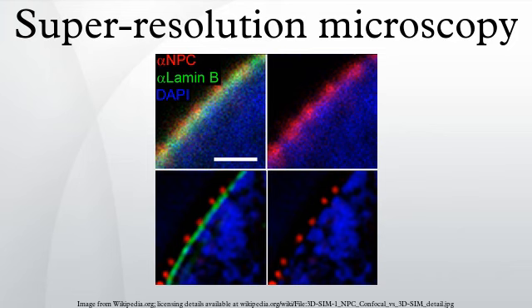There are two major groups of methods for functional super-resolution microscopy. Deterministic super-resolution: the most commonly used emitters in biological microscopy, fluorophores, show a nonlinear response to excitation, and this nonlinear response can be exploited to enhance resolution. These methods include STED, GSD, RESOLFT and SSIM.